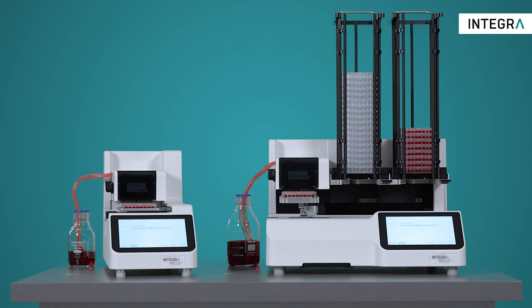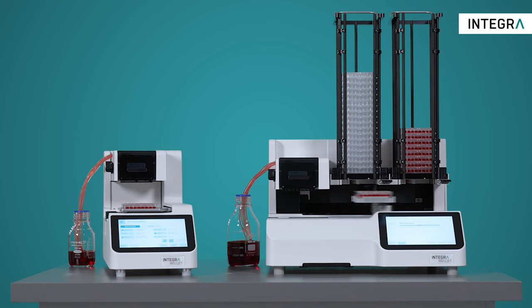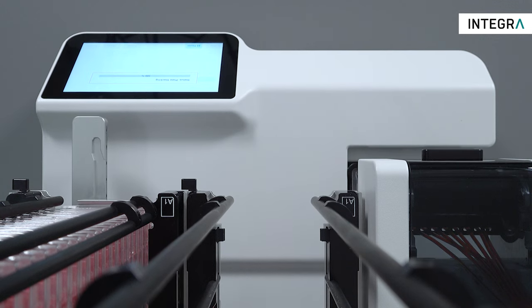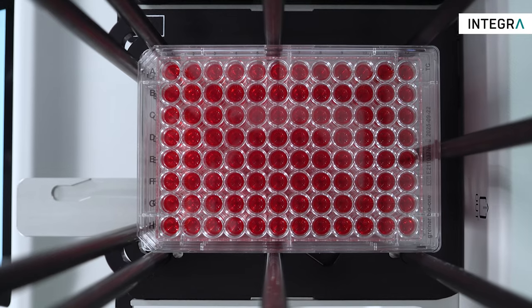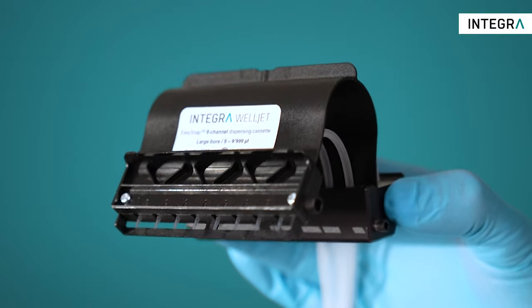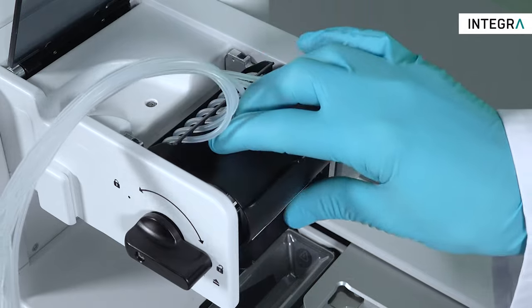Designed for speeding up your daily routine of filling microplates or adding reagents to your assay, Integra's brand new WellJet Reagent Dispenser offers fast, precise, and reliable dispensing of liquids with breakthrough dispense cassette technology to minimize your running costs.